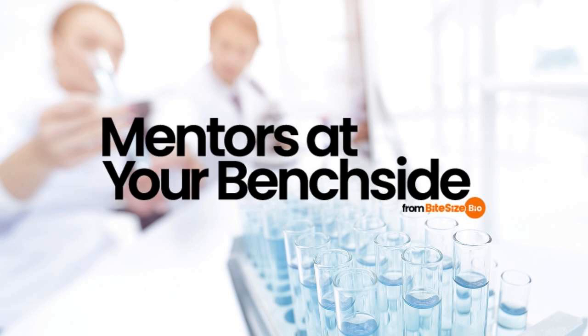Optimize filtration to eliminate sample debris. To eliminate as much cellular debris from your nuclei sample as possible before moving to sequencing, aim to learn what specific filtration your sample will require. The size and abundance of cellular debris will vary depending on your tissue type and lysis method, so choose the pore size of your filter accordingly. We will discuss other steps to eliminate sample debris later in this episode.